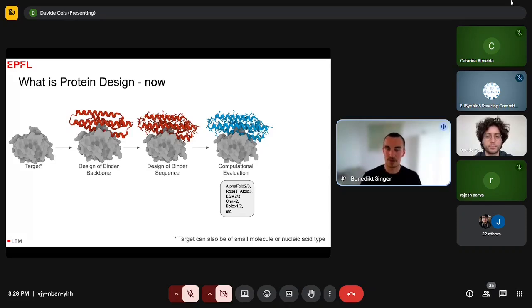So there are certain metrics such as the pAE or the pLDDT or other different metrics which now come out, which can correlate somehow weakly with if this value is high or low enough, this design might actually yield something in the lab. Next slide, please.